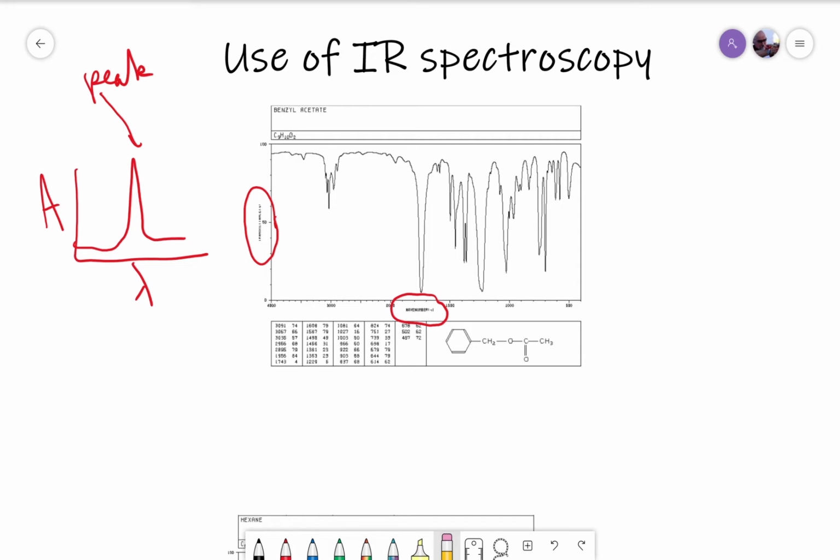Organic chemists, who like to do things backwards, instead of doing absorption, do the exact opposite of absorption, and IR spectra are typically rated as %T, not absorption. So when something absorbs, that means the %T goes down because less light is transmitted through it.